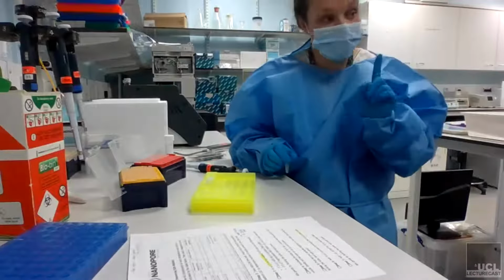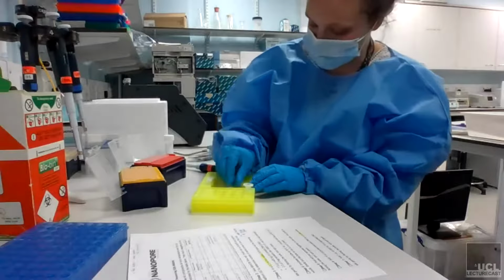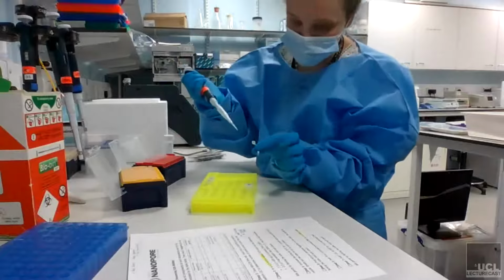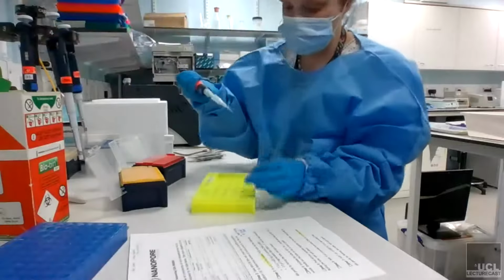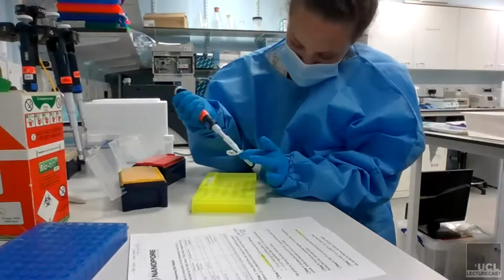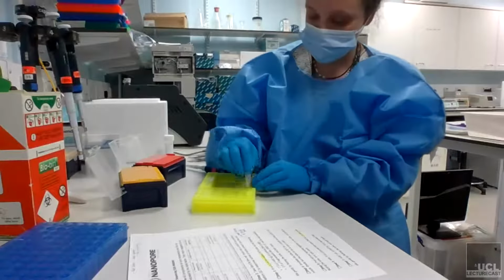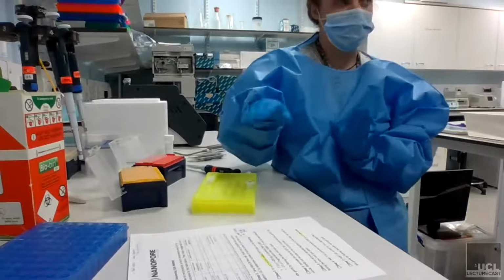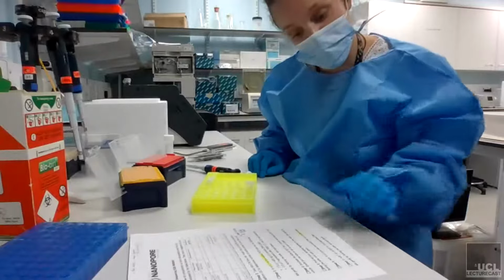This always makes me sad, because you only need 10 microliters of all of those samples combined, so you're getting rid of quite a lot of DNA. But anyway, you only need 10 microliters of your pooled samples, which I have mixed. I'm putting this into a low bind tube. So that's now 10 microliters of my combined samples. In theory, because I have 5 samples, there should be about 2 microliters of each sample in my pool, but that will vary depending on how many samples you have.